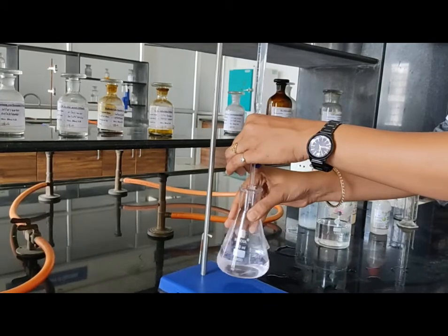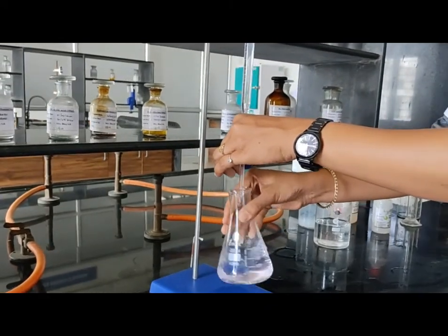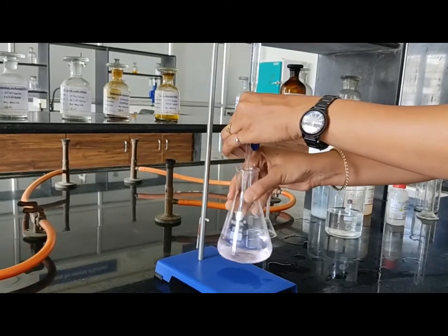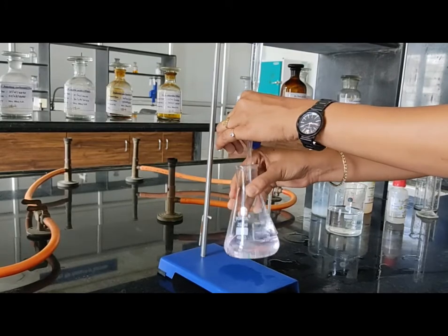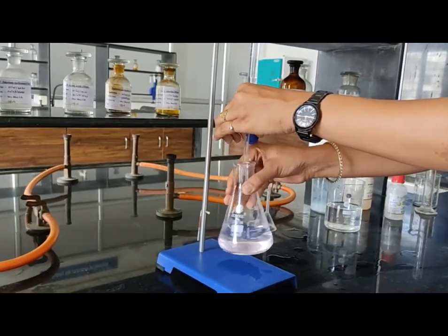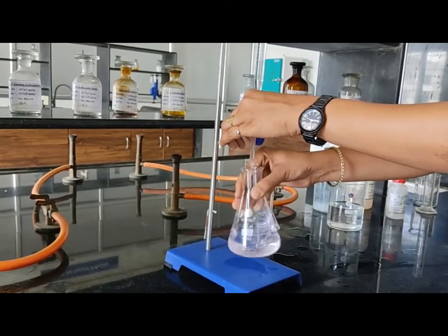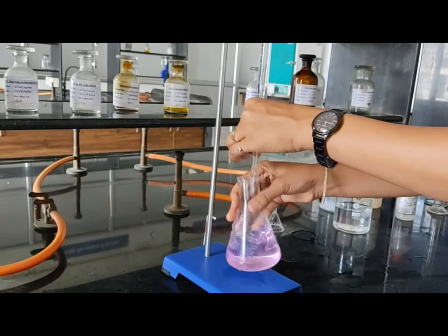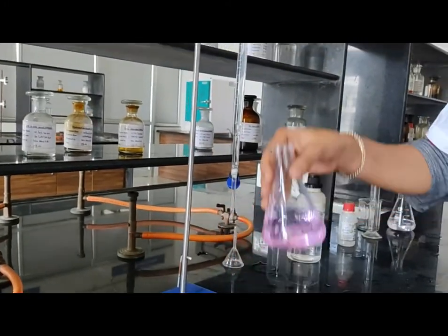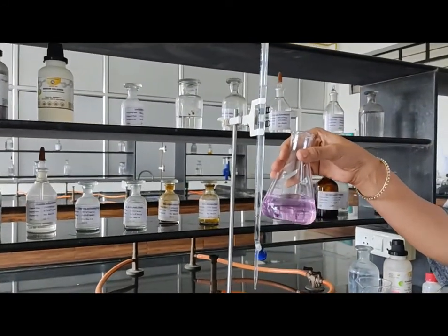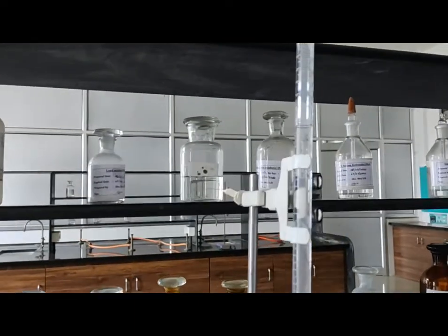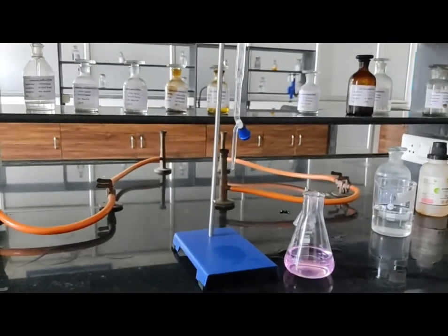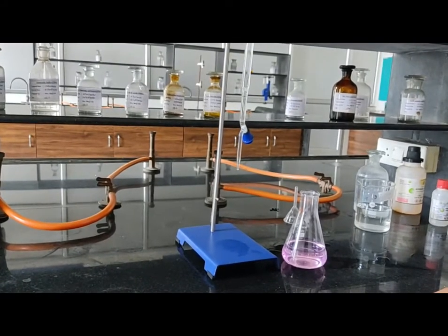During titration we have to continuously stir the conical flask so that the reaction occurs simultaneously and we get a clear and sharp endpoint. Now this titrate is converted from colorless to pink. This is our endpoint and our burette reading is 31.4. In a similar way we have to repeat the procedure three times, then calculate the mean and use that mean to find out the percent purity of the boric acid.